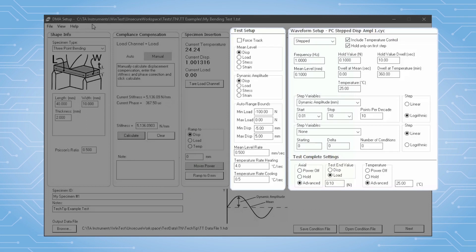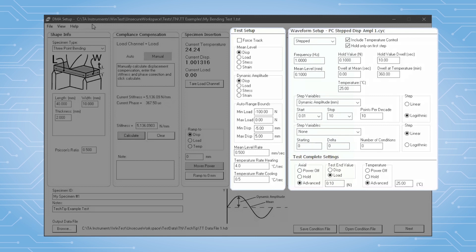We define the DMA test conditions with both the test setup and waveform setup sections. In test setup, we define the parameters we wish to control for the primary oscillation: displacement, load or force, stress or strain. These can be defined uniquely for the mean and amplitude of the applied oscillation.